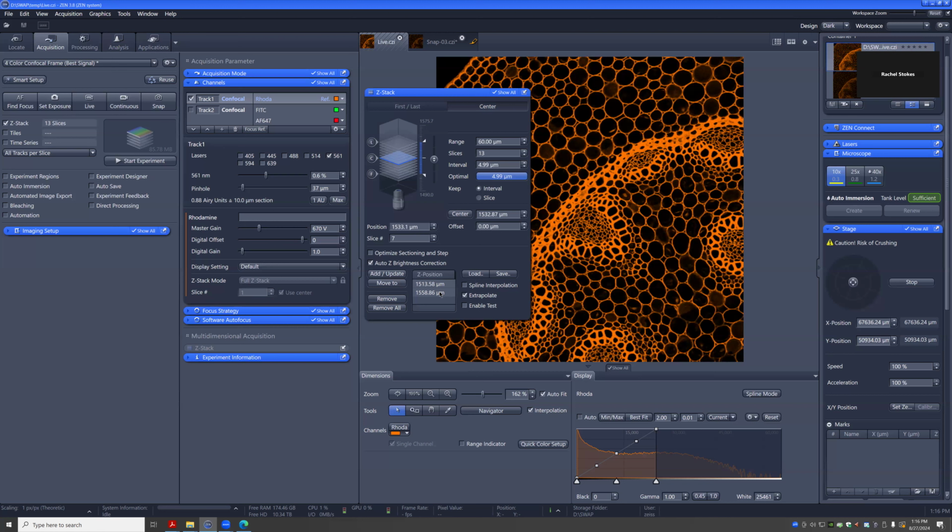If you're trying to get an idea of what things look like in 3D, you just want to get a little more signal from the deeper tissue, then that should be totally fine. But yeah, do keep that in mind if you're later down the line trying to do any quantifications on that. If it's been treated with this, you want to make sure you're not drawing strong conclusions on the intensity itself, because that's going to be highly variable.